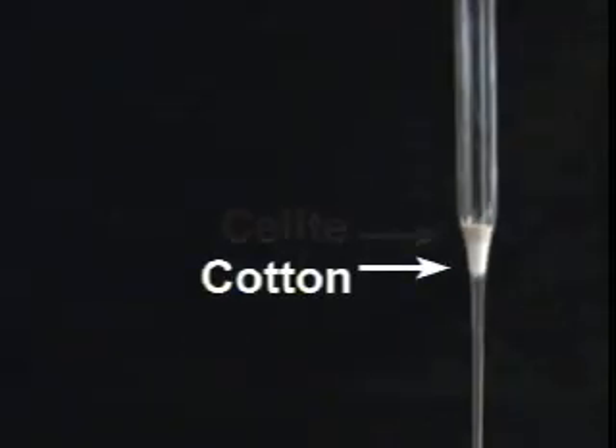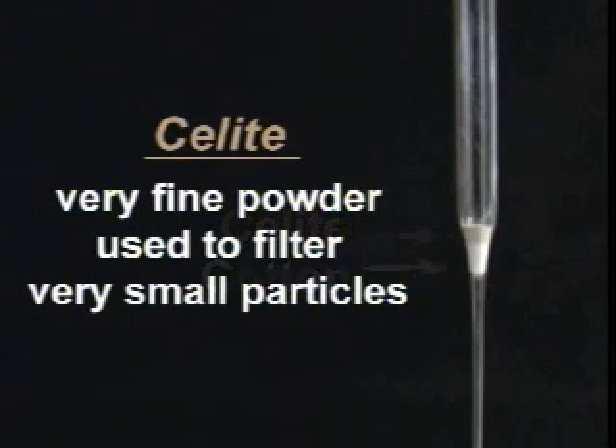But let's add something extra. As you can see, here is the cotton, but sitting on top of it we've placed celite. What is it, you may ask? Celite is a very fine powder used to filter very small particles, and we'll be using it in this filtration.